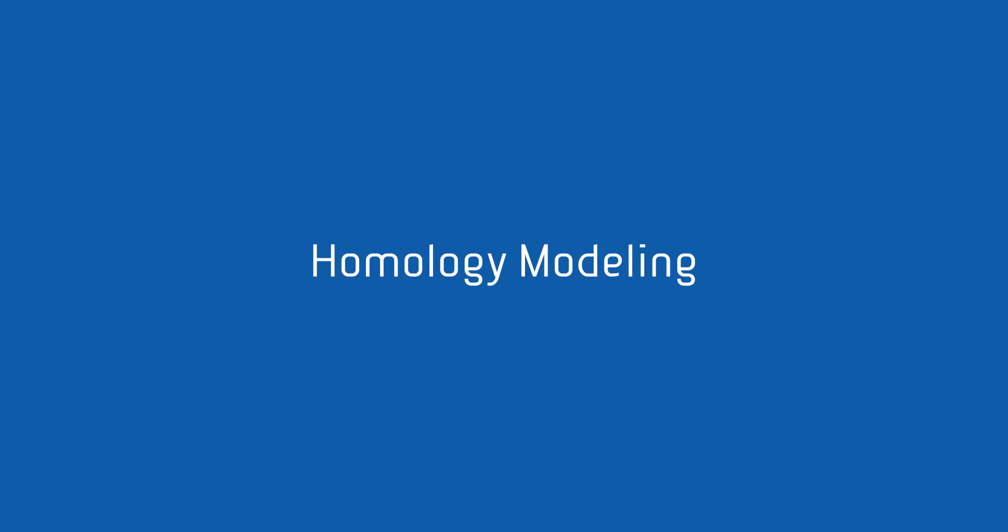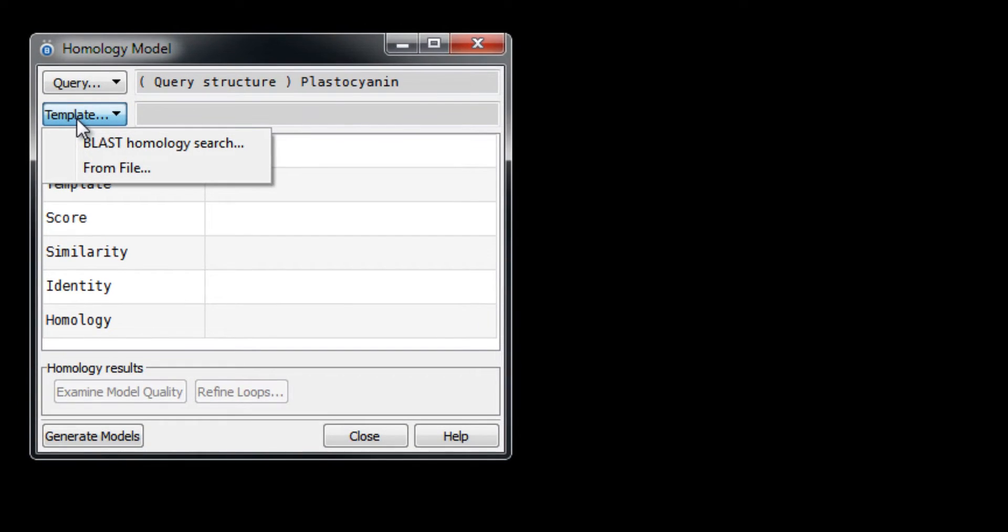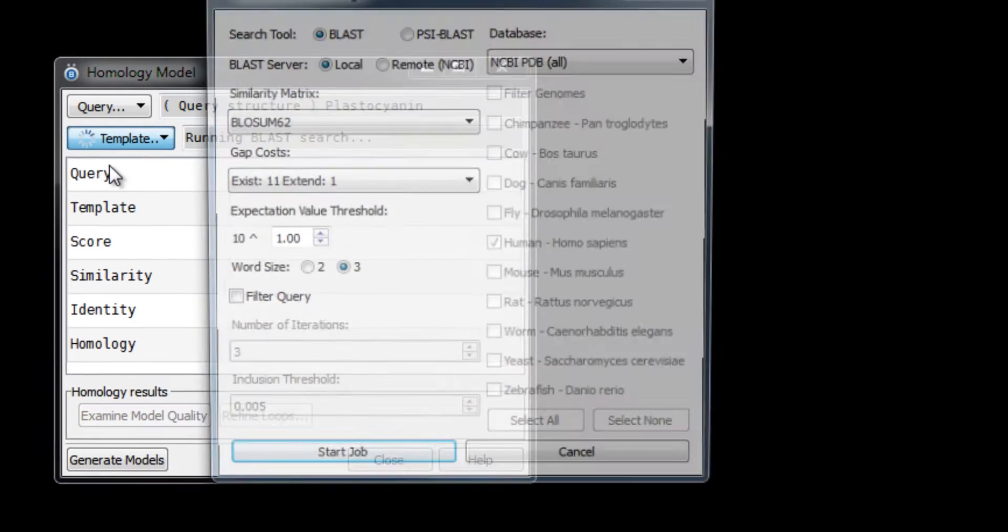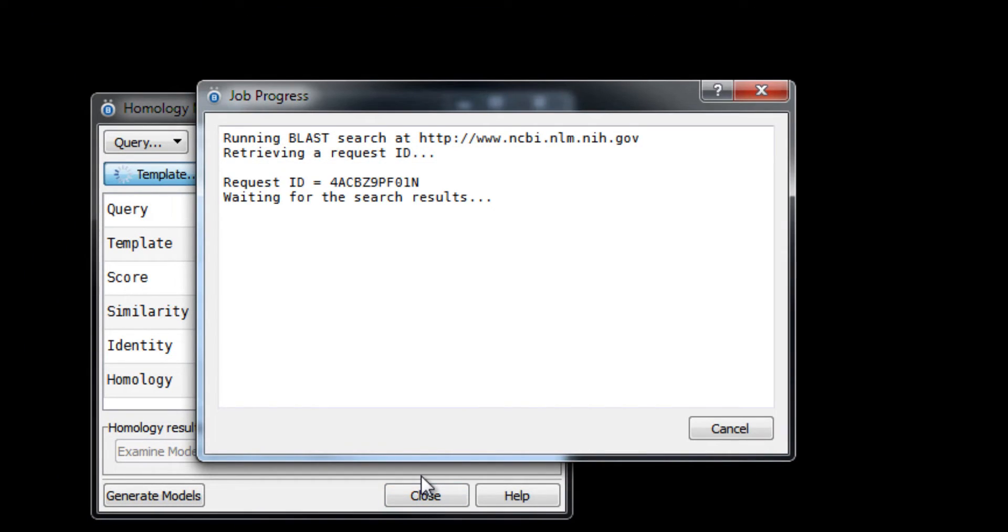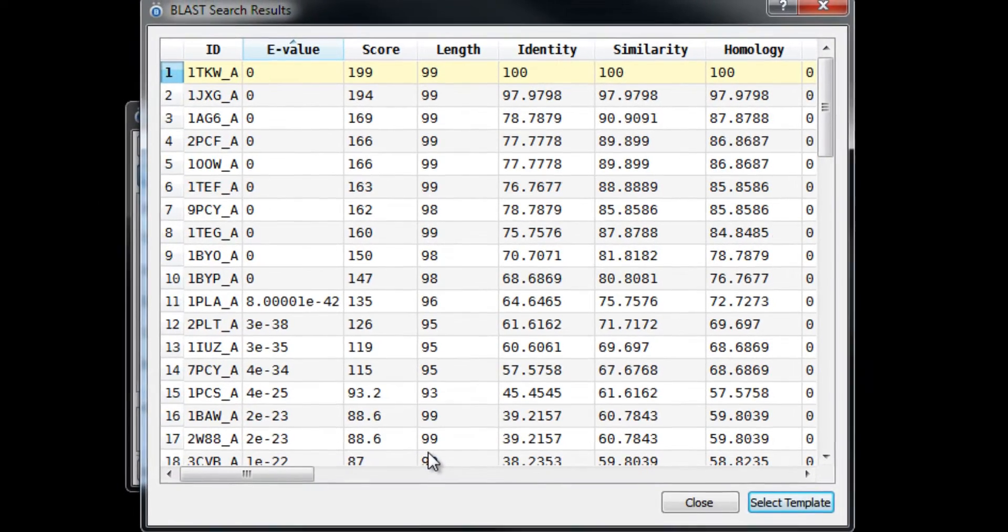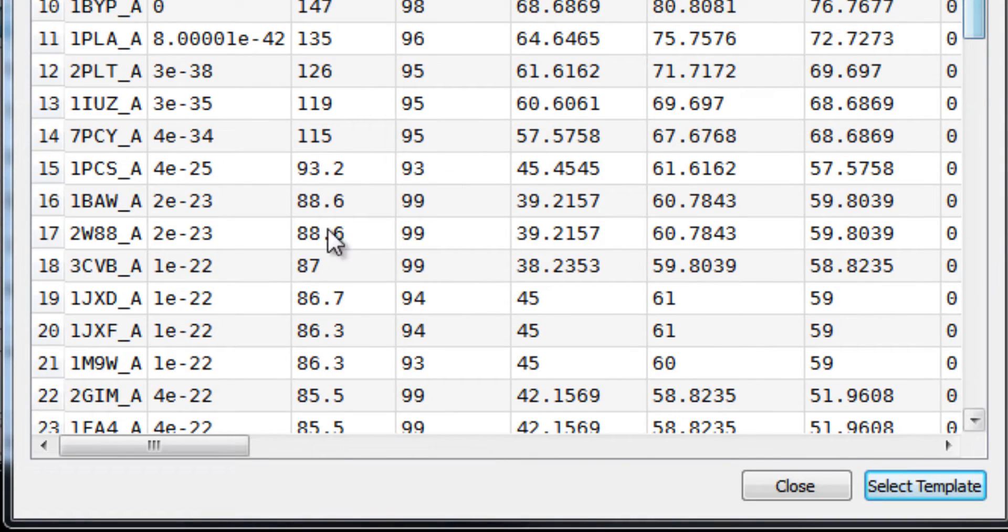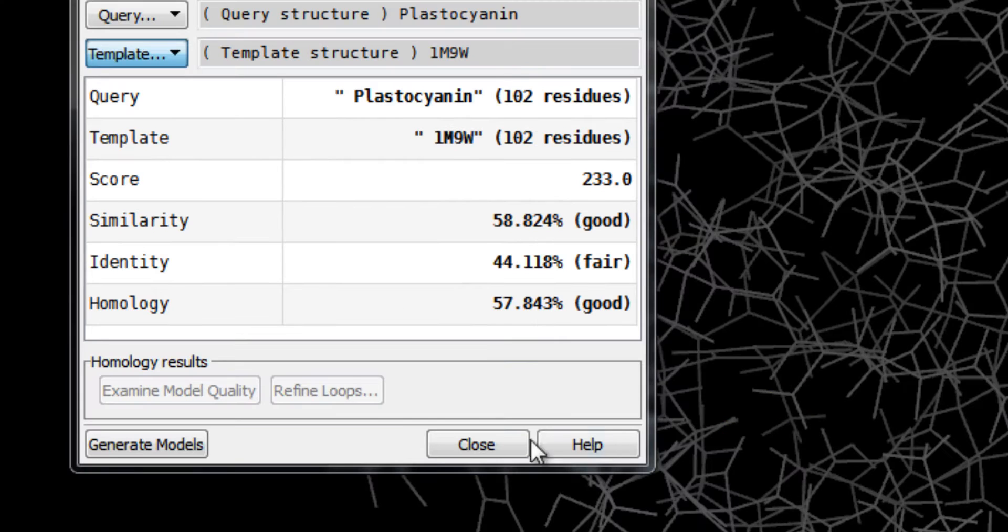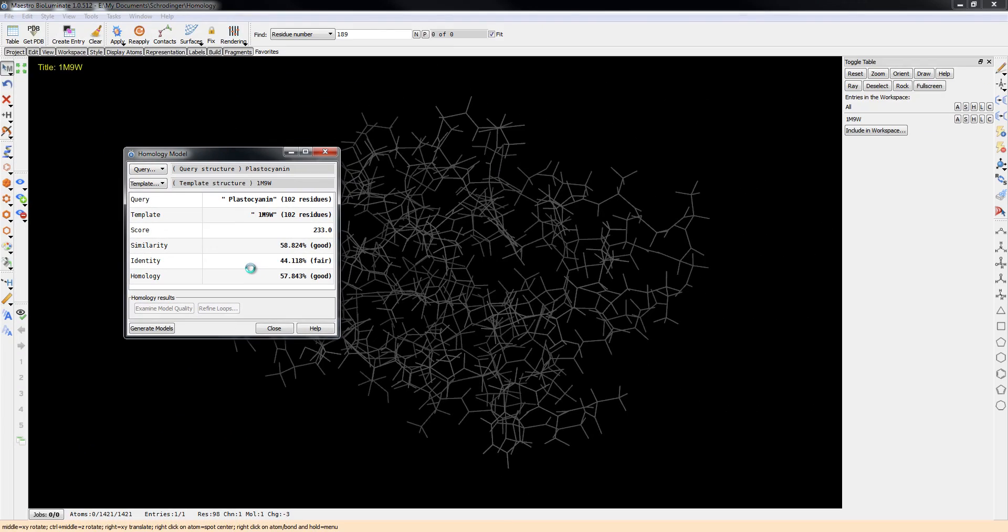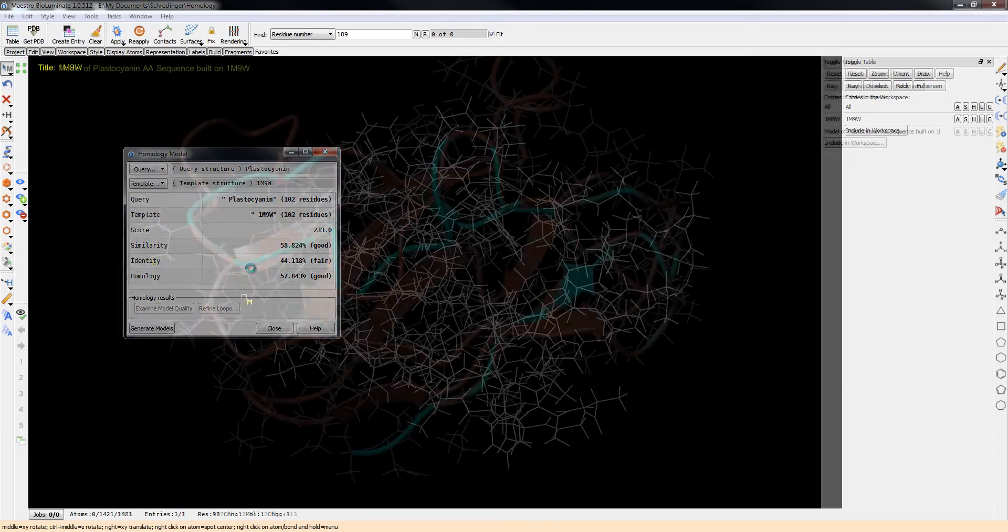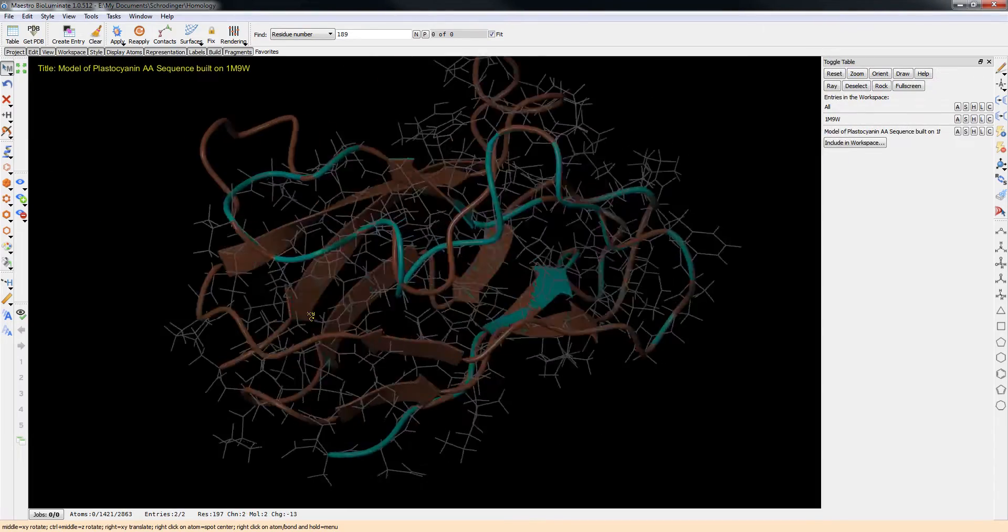BioLuminate contains a complete set of homology modeling tools. In simple mode, easily select the query sequence, then run a BLAST search to browse for ideal homologues. This approach is fast, and a full homology model can be generated in just a few minutes.